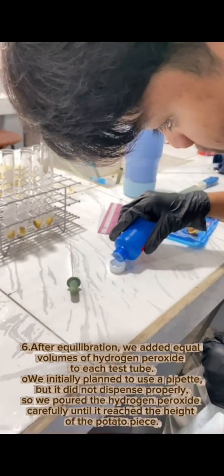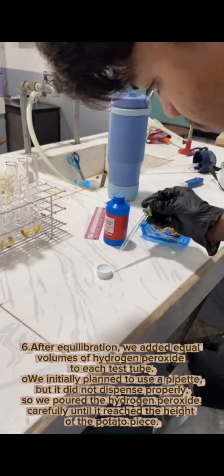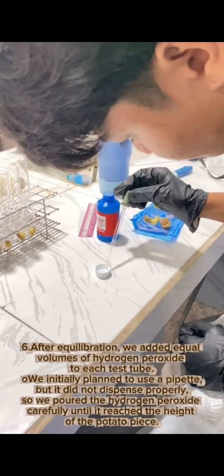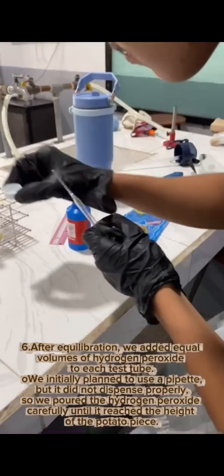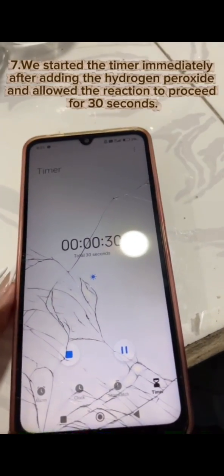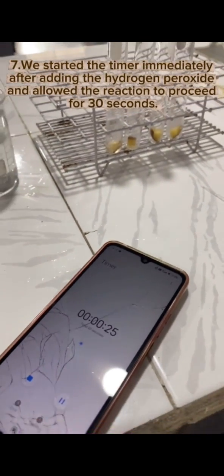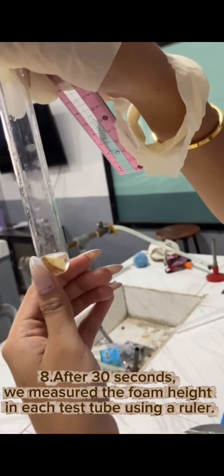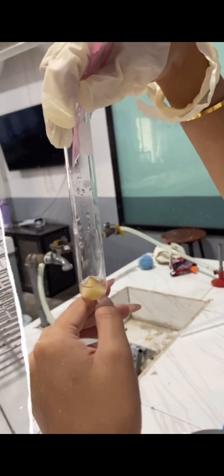After equilibration, we added equal volumes of hydrogen peroxide to each test tube. We initially planned to use a pipette, but it did not dispense properly, so we poured the hydrogen peroxide carefully until it reached the height of the potato piece. We started the timer immediately after adding the hydrogen peroxide and allowed the reaction to proceed for 30 seconds. After 30 seconds, we measured the foam height in each test tube using a ruler.